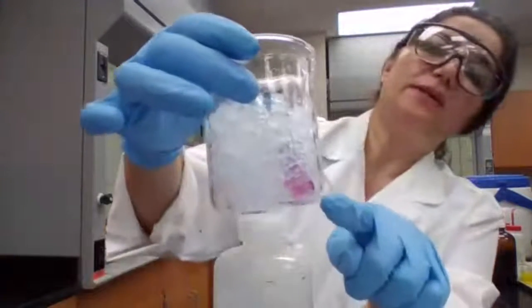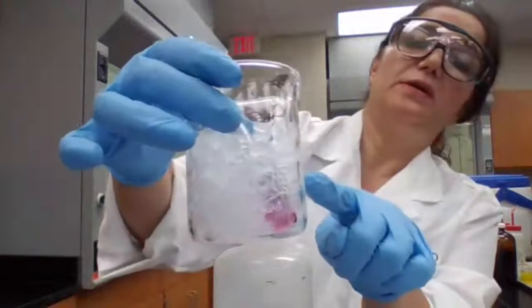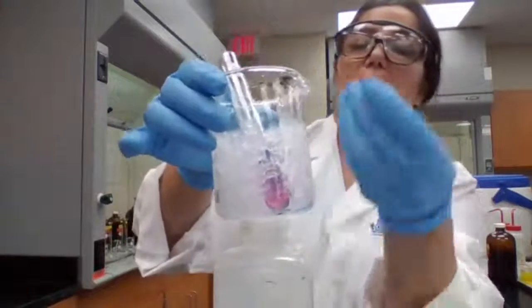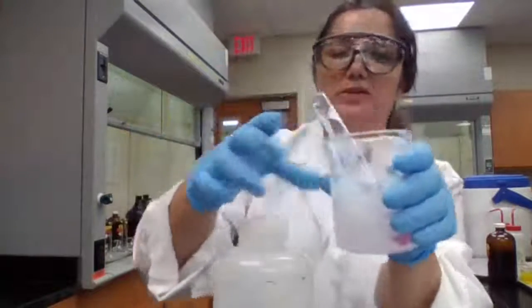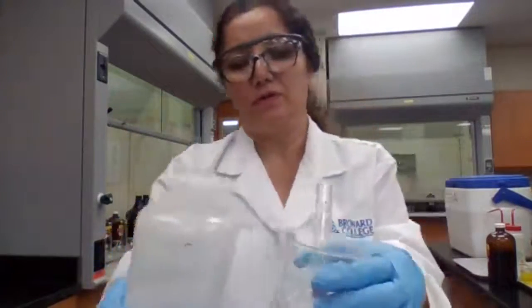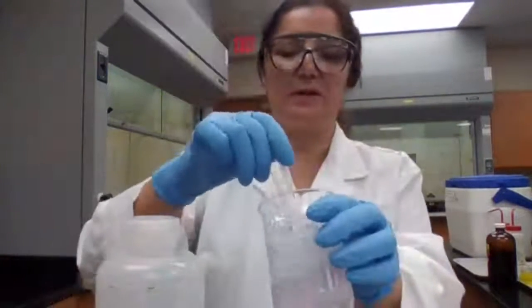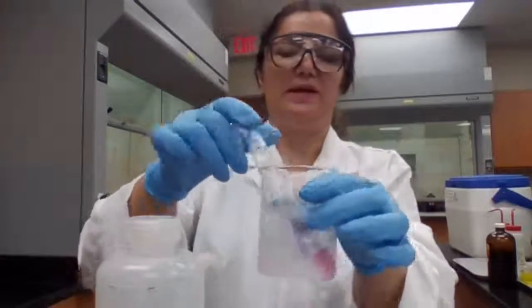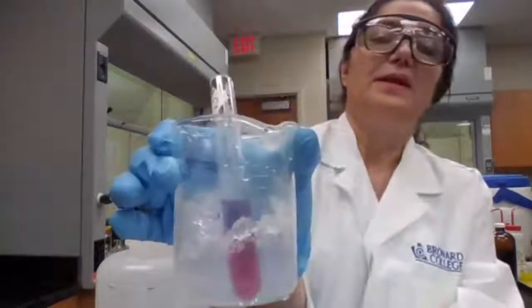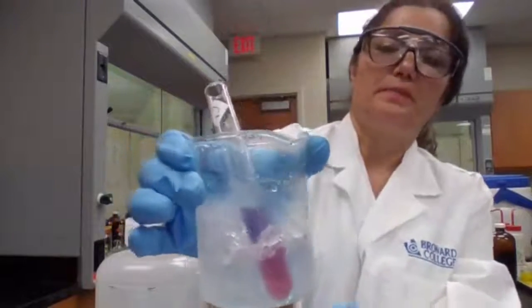See the part that is already cold is turning color and is working its way up. So the color is changing. Just want to make sure that the whole test tube is in the ice water bath.